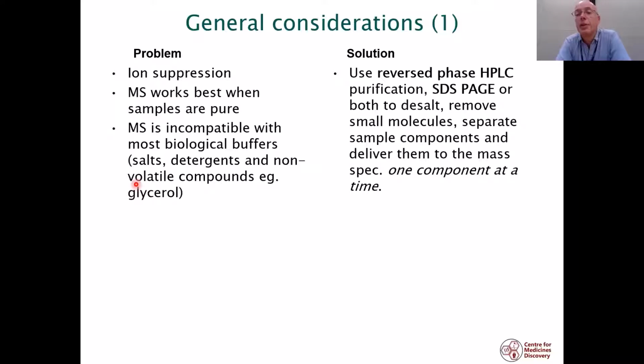Well, the solution to this has been around for a long time, and the solution is either reverse phase HPLC purification or SDS-PAGE purification, or very often both of these, which function to desalt the sample, to remove small molecules, and crucially, to separate the components of a mixture so that they can be delivered into the mass spectrometer one component at a time.